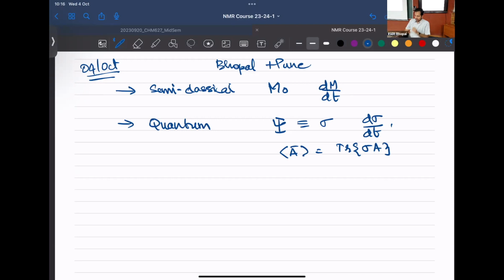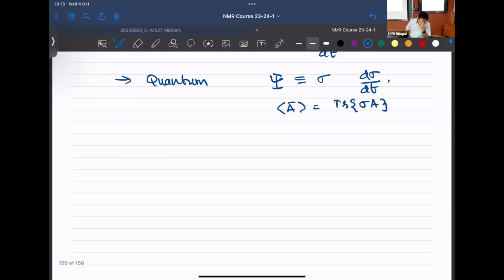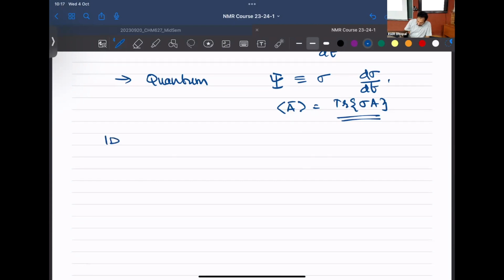So from this part onwards, I'd like to focus a little bit on the practical applicability of NMR. It's been quite abstract in terms of catching up the theory and what an outcome means. I hope until here, people are at least able to understand how a 1D NMR spectrum is obtained.